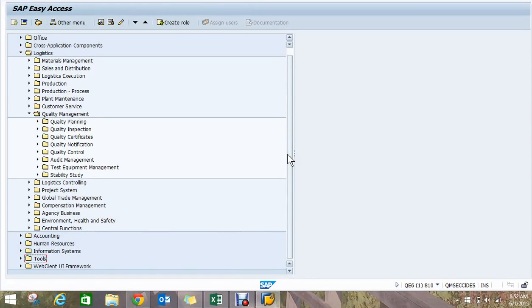What we're going to look at is the sample management label printing, and this is one of the features that when you turn sample management on, you're able to print labels per each sample. Let's look at the master data needed to create the samples.